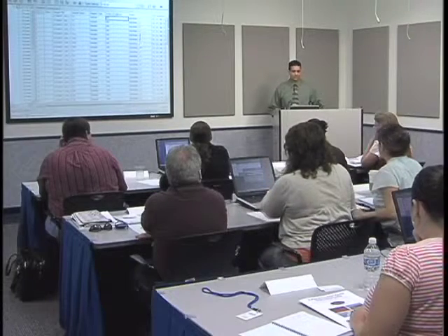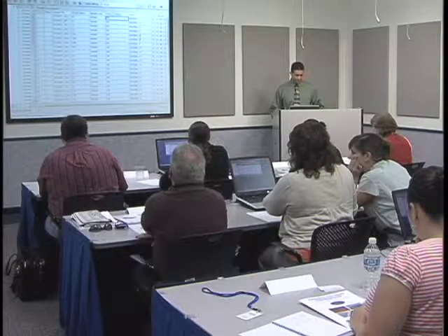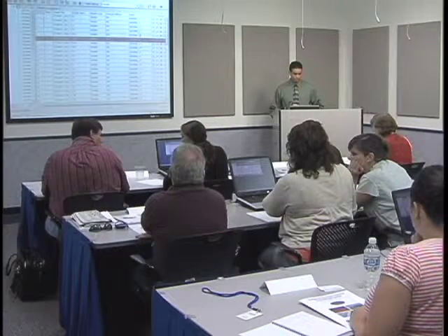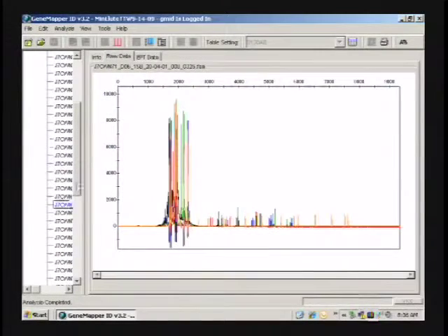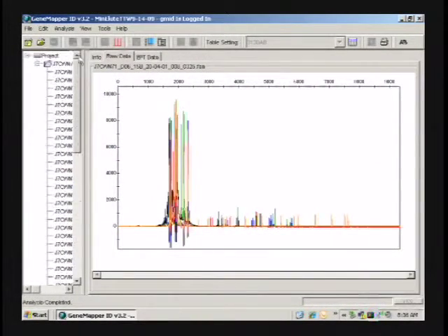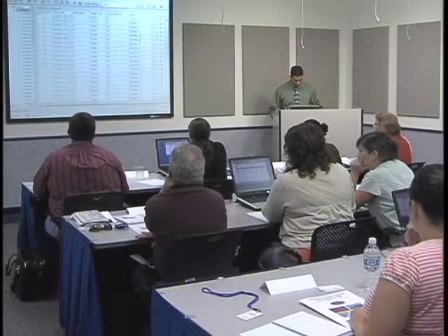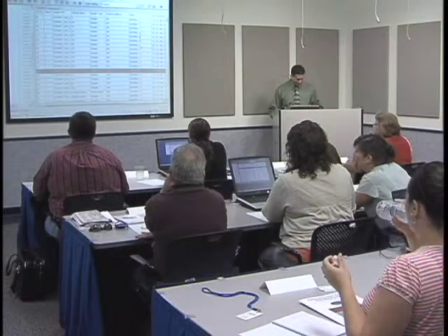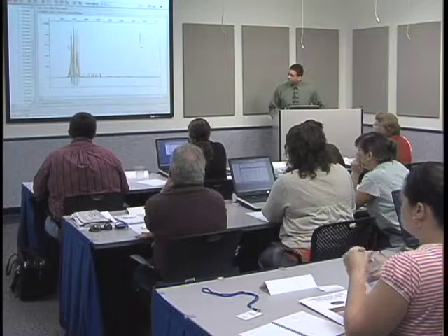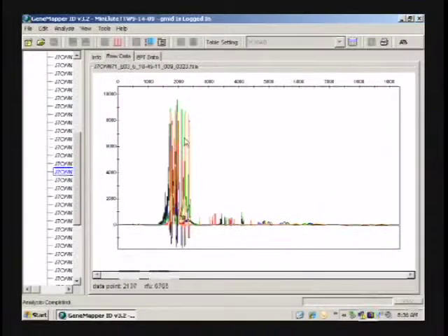There was only one sample that I had a bad injection on, sample number 6. So whoever had sample number 6, if you would like to see that data, it should be good in the second injection, but that was, nope, that's not bad. Okay, that's not the right one. Oh, that's 15B, I'm sorry. Sample number 6. Yeah, it started off okay, but then it failed. So that was just a bad injection. That has nothing to do with the MinElute or anything.